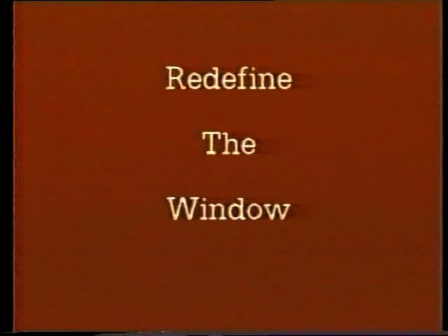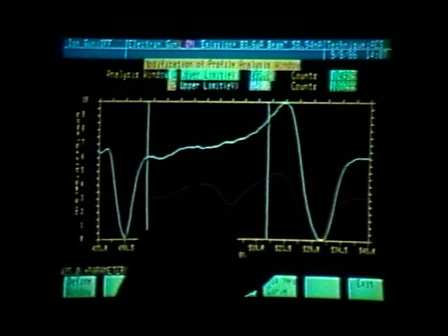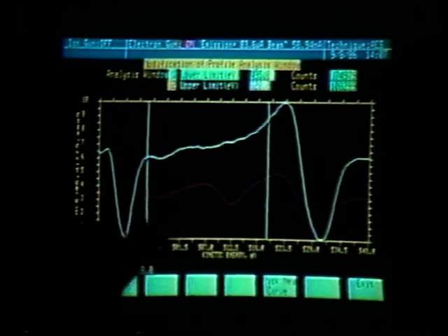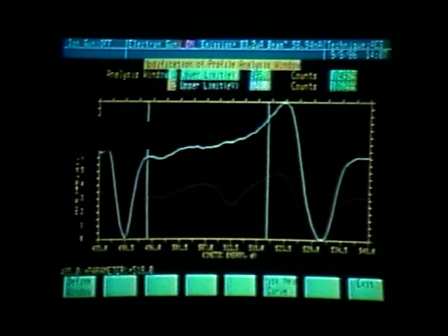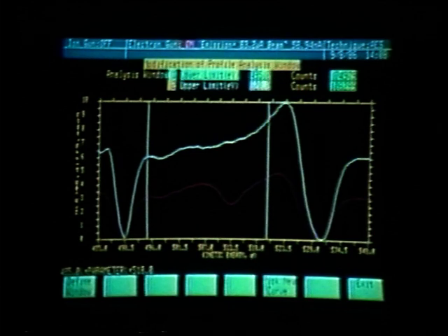Looking at the graph, let's redefine this window. What we would like is to, for sure, we want to include the peak-to-peak height of oxygen using the oxygen peak as a guide from cycle number 1, but we also, by looking at the second graph from cycle number 10, we also do not want to include a positive or negative excursion that would give us erroneous data.